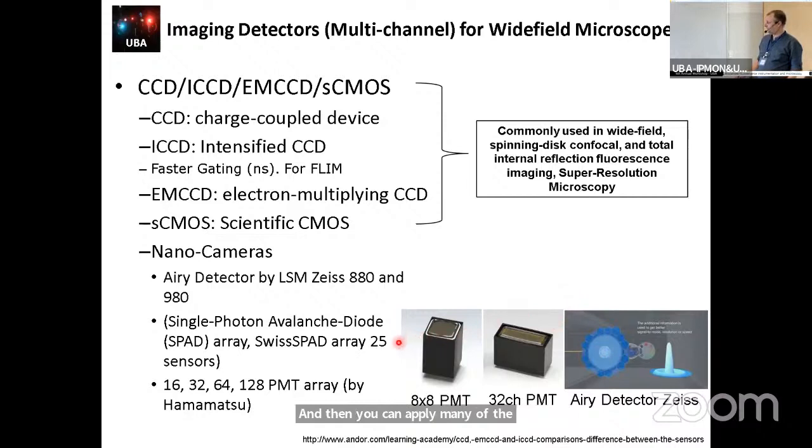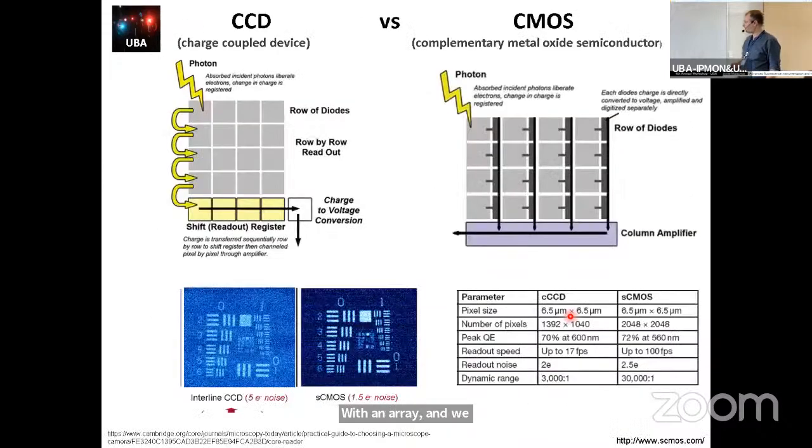And on Wednesday, Giuseppe De Vici-Domini is also going to talk about an array of APDs for doing all this imaging like FLIM, FCS, etc. with an array, and we will learn how important this can be for some applications.